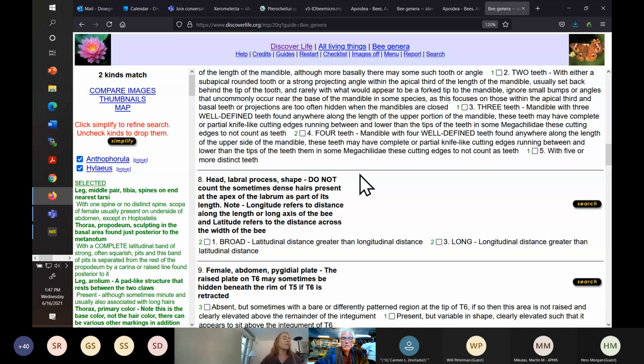Also, if you were, as some people do, particularly old school, to create a museum quality specimen, you might also spread the wings and flatten them and use pins to shape where the legs go. That's all done immediately after killing. You can do it immediately after alcohol, but alcohol tends to stiffen the specimen. It becomes more and more difficult the more time something has been in alcohol. And if you have a dried specimen, it's impossible.